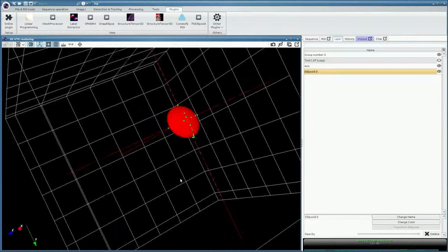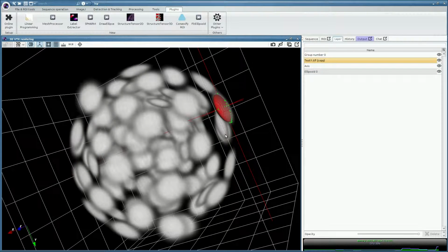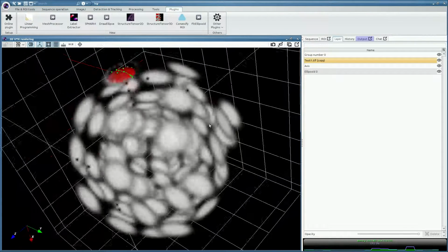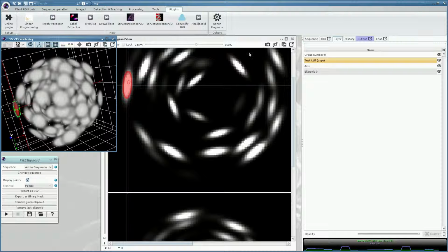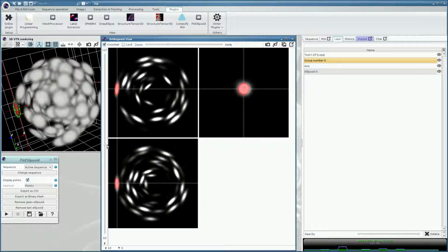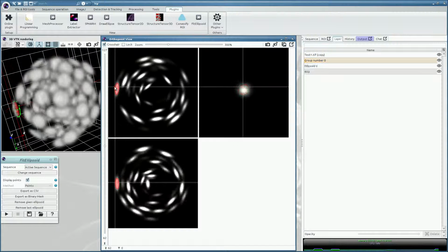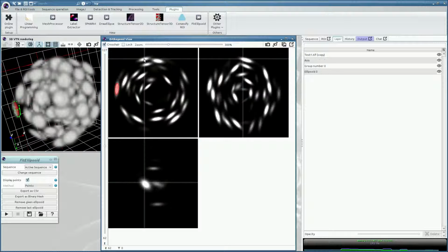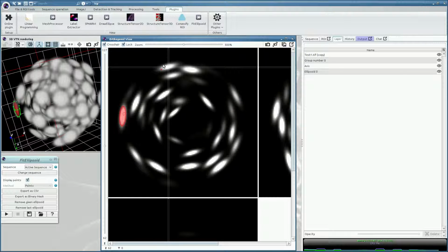And this is the result. Okay, and if you compare this to the image contents, well, it's convincing. The algorithm did a good job. Okay. So when you are done, you can check that your result is correct by, for instance, moving this, and you can see the result in each of the three orthogonal views. And if you're happy, you can continue working by locking, clicking on some points around the boundaries.